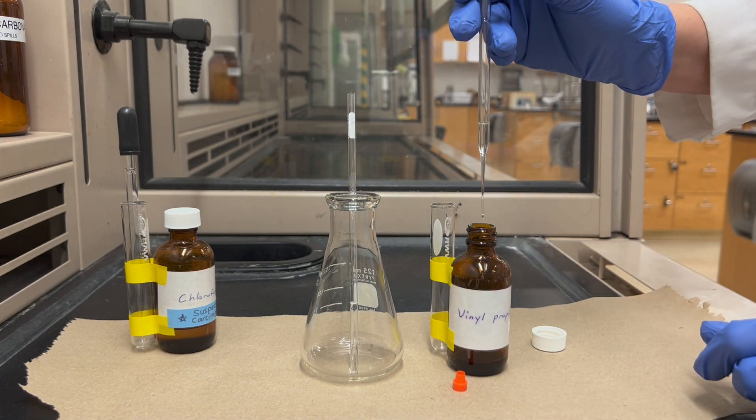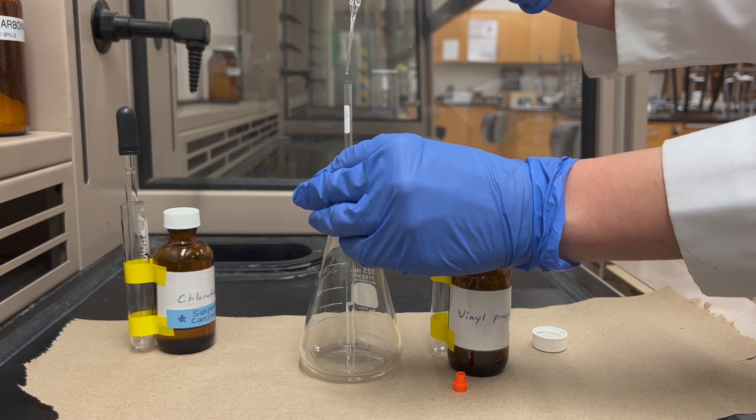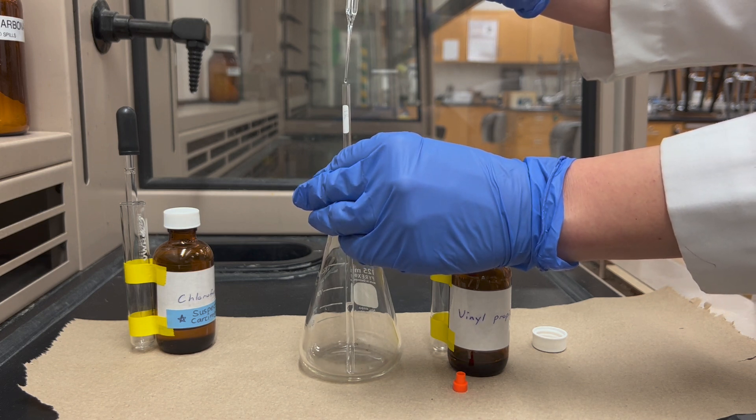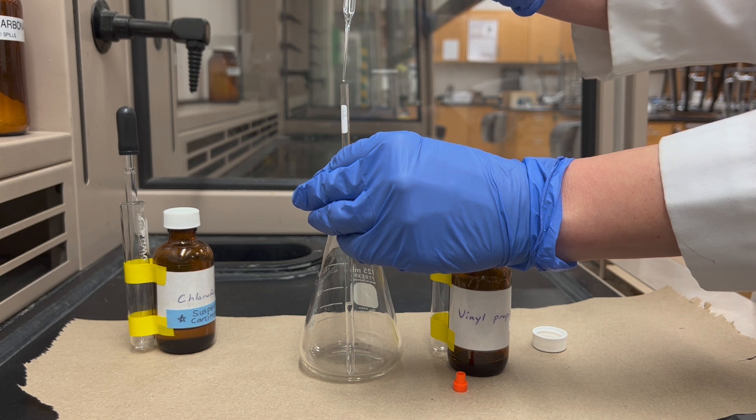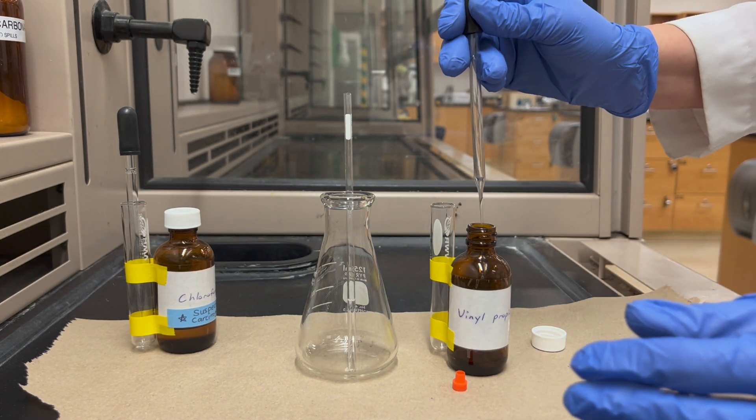Now I'll add that to the tube. To try to prevent contamination on the pipette tip, I'm going to try not to touch the tube with the pipette. I'll be adding six drops to the NMR tube.